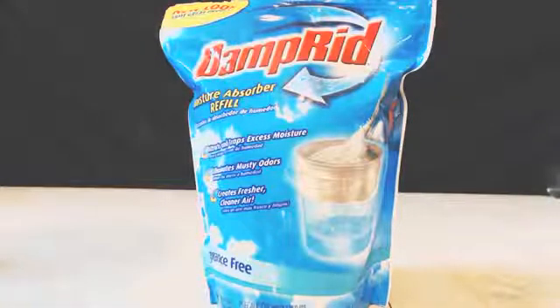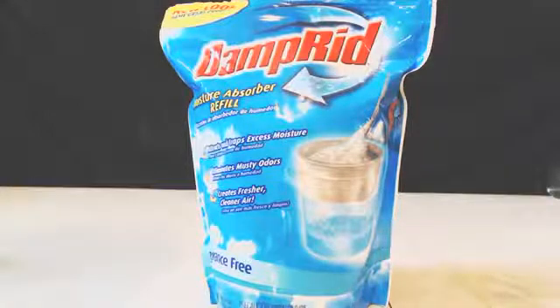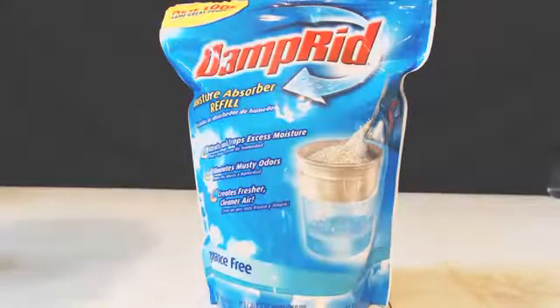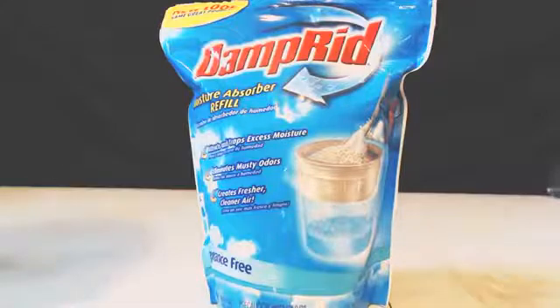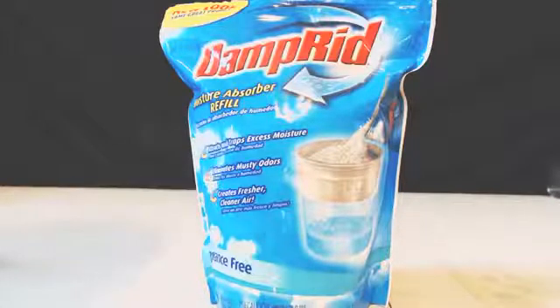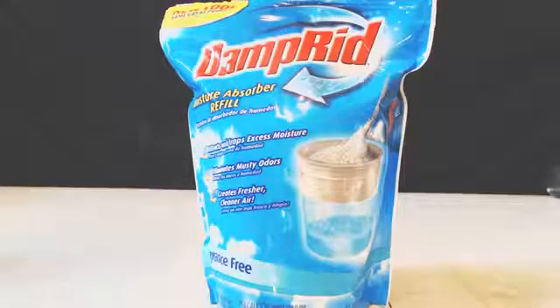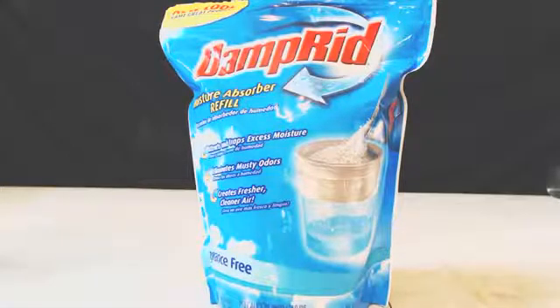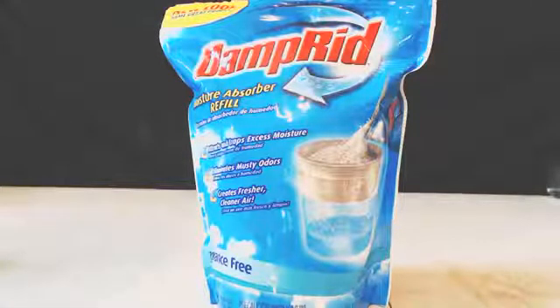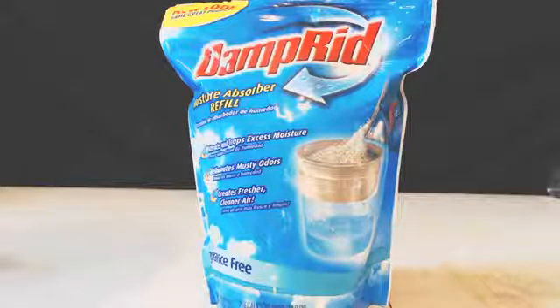I don't know if you can just heat it up in the oven. It might decompose if you heat it. This also forms a complex with alcohols, so lower ones definitely like ethanol, methanol. So if you have trace amounts of alcohol in something, you can throw this in and see if it reacts with it.